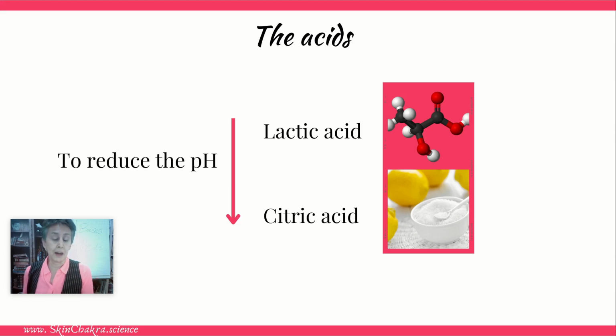Vinegar is not a pure ingredient, it contains minerals and other components, not impurities, but components that can affect the color, the scent, and the stability of the product. And vinegar is a weak acid, and you need a much higher concentration compared to lactic acid or citric acid.